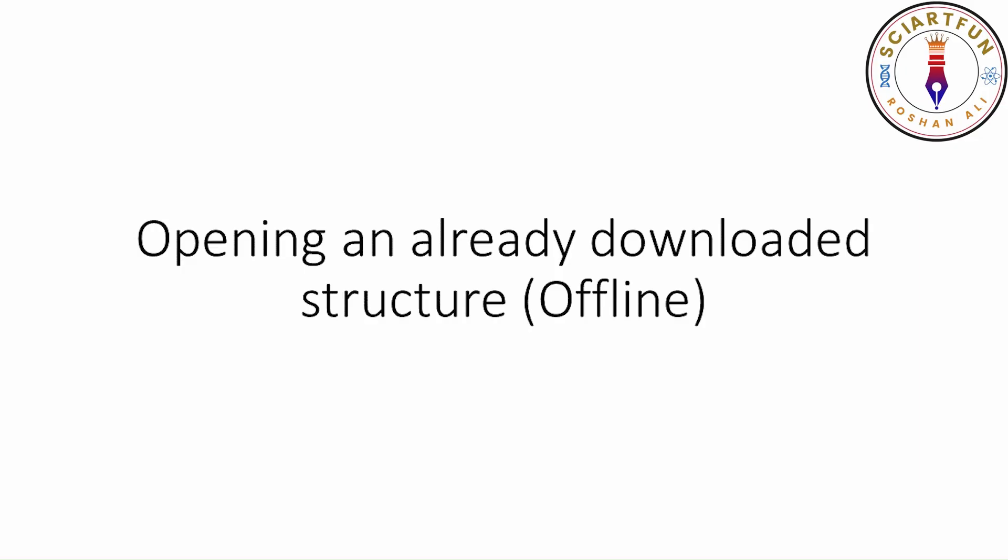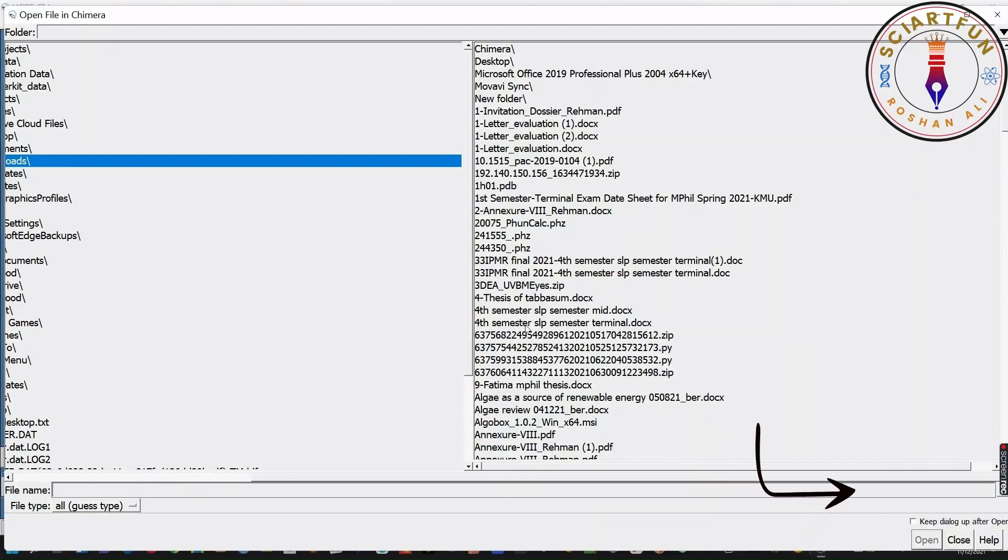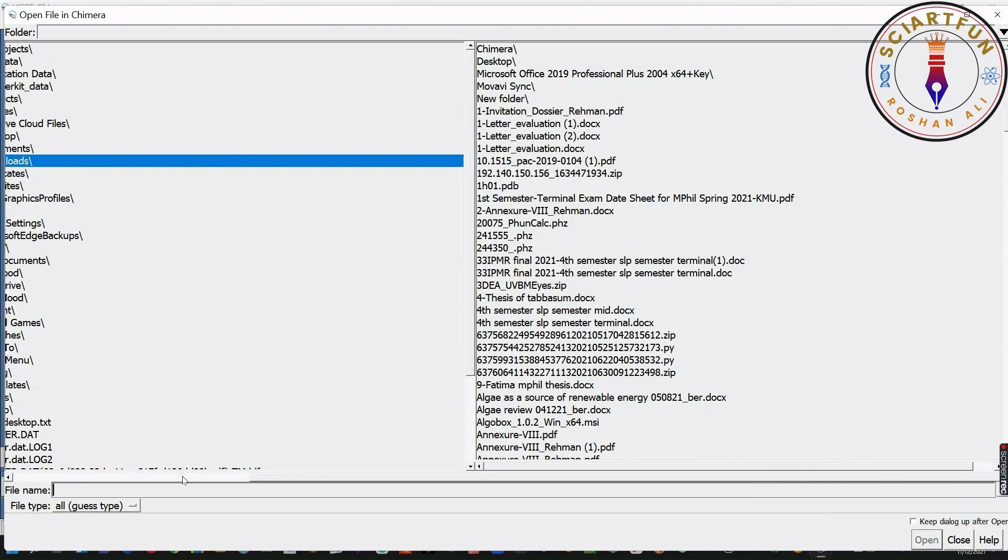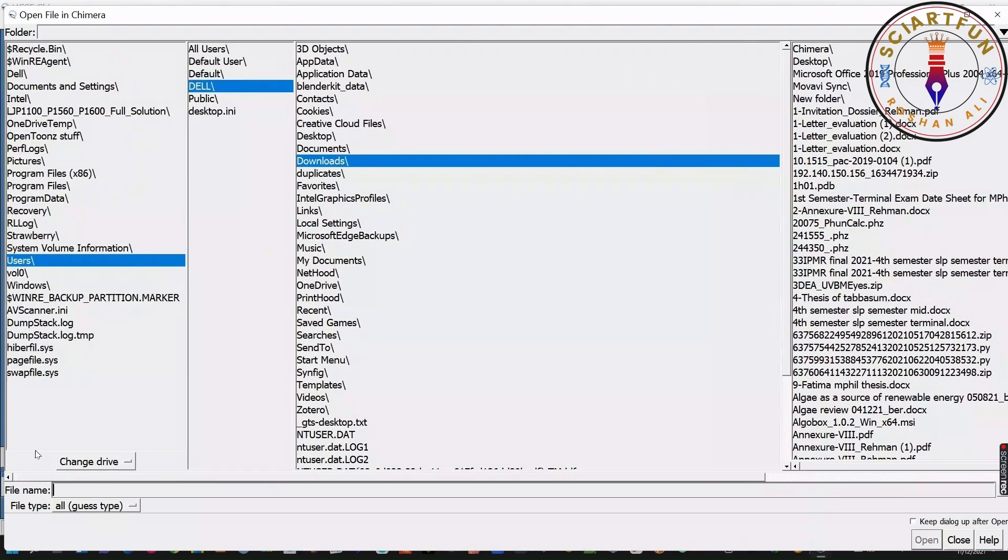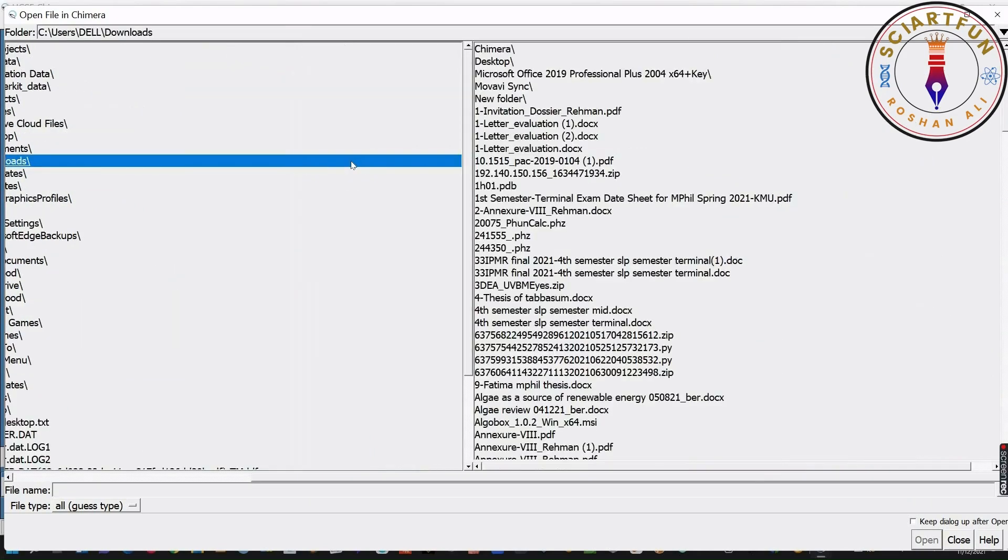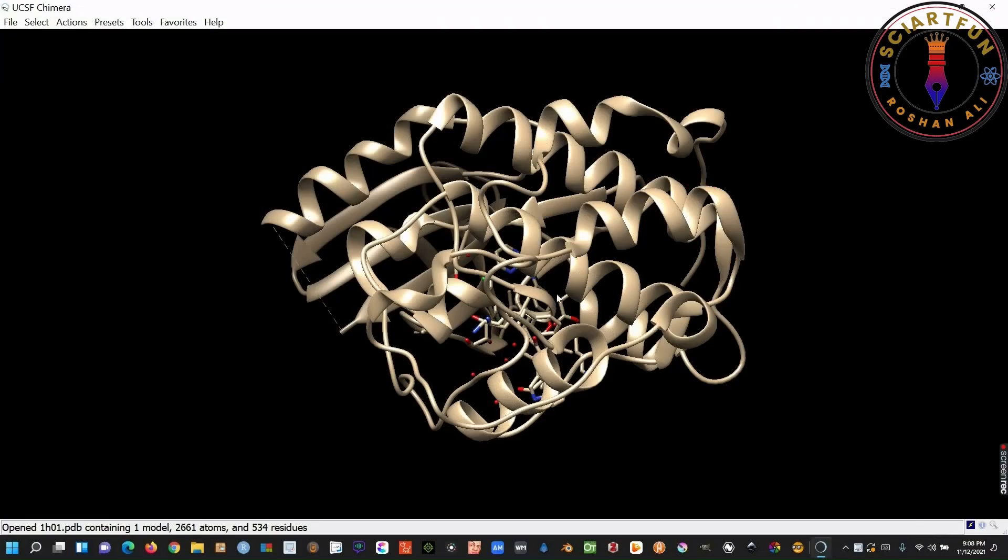Opening an already downloaded structure. One of the methods is to click this browse button. This will open this window. Go to the location where your structure is downloaded. I have my structure in the download folder. This is the structure I want to open. Just click it and open. So, here is your structure.